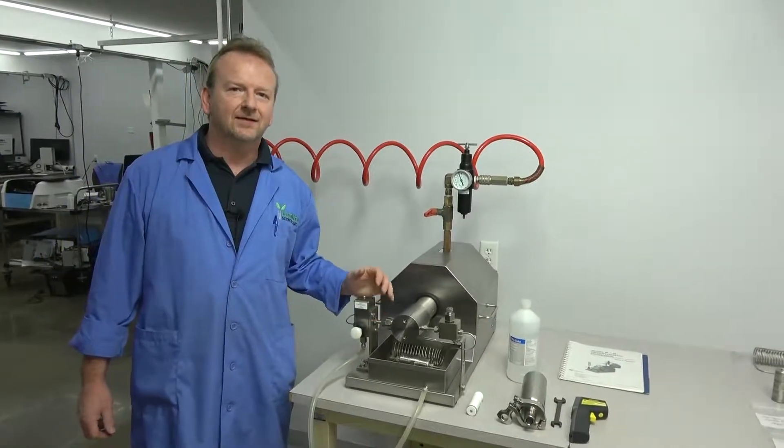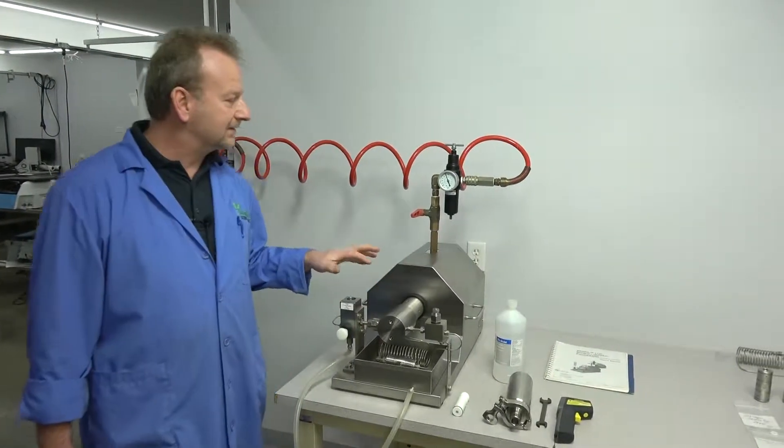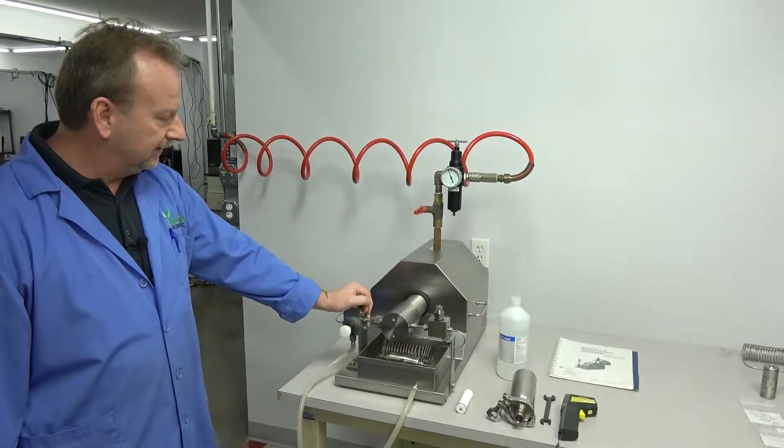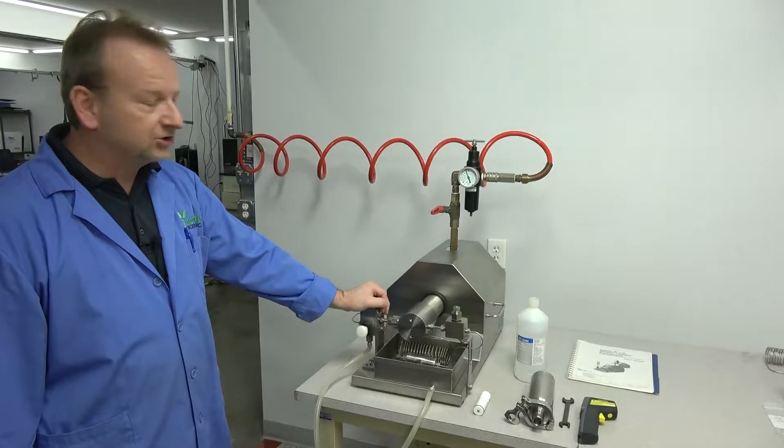Hi, I'm Rich with New Life Scientific, and today we have a Microflix M110L, a very nice machine. It's an older one, but in fantastic shape.